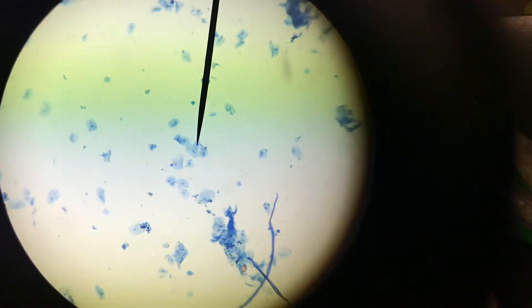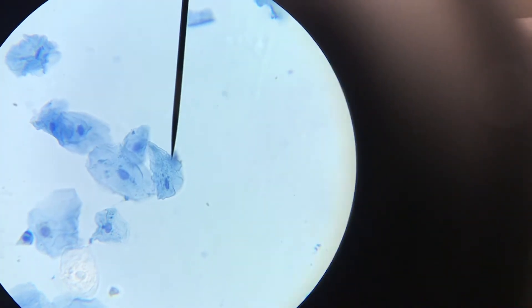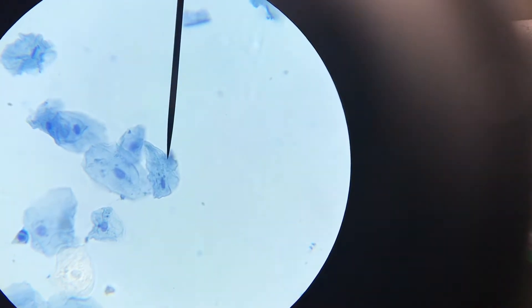Now we have prepared a wet mount slide using cheek cells. Under the lowest magnification, the black pointer is pointing directly to a cluster of cells. Under medium magnification, the black pointer is touching a cluster of cheek cells. Under high power magnification, this is what your cheek cells will look like — a cluster of cheek cells. They are not always in clusters; keep that in mind.